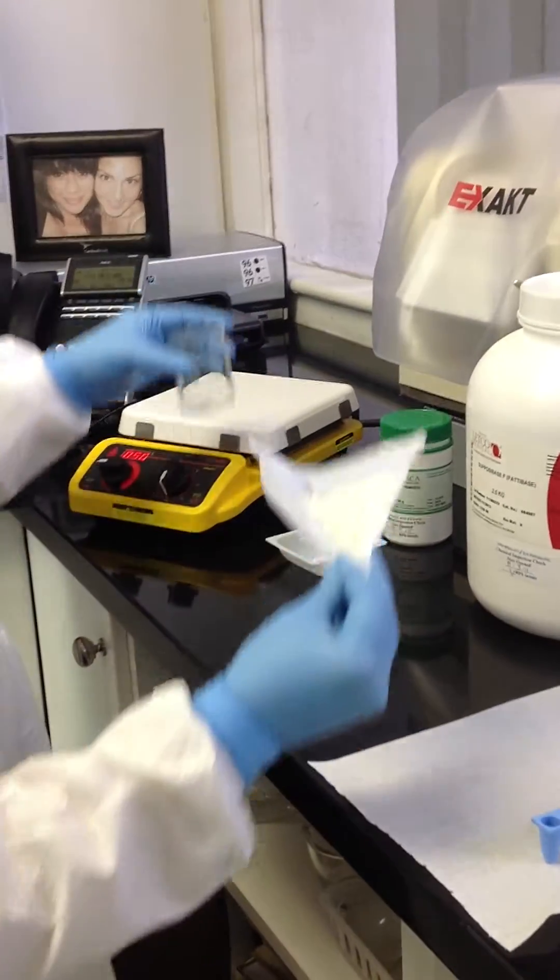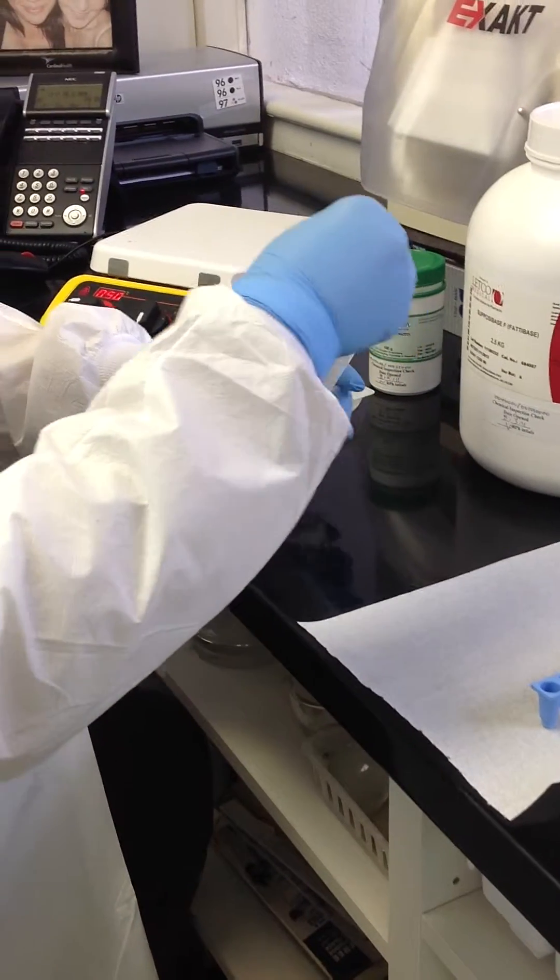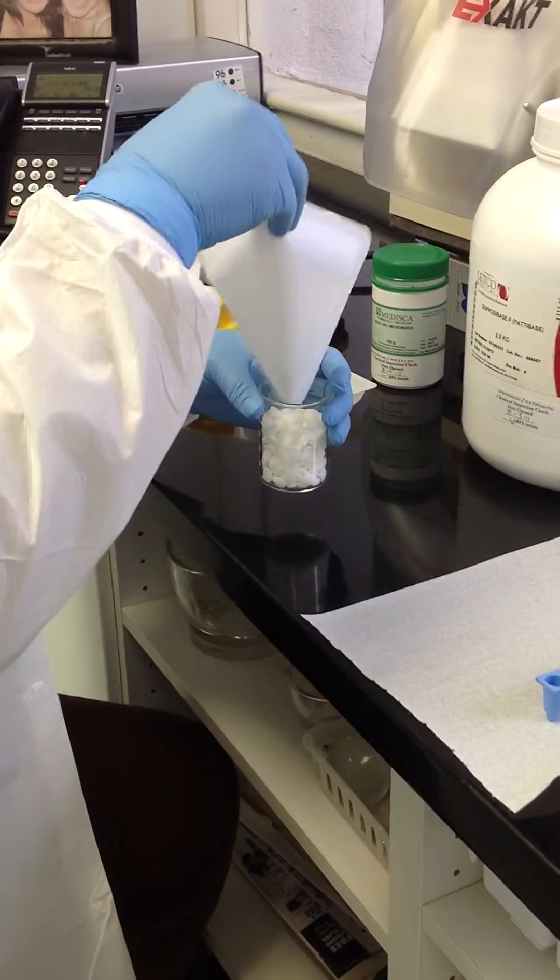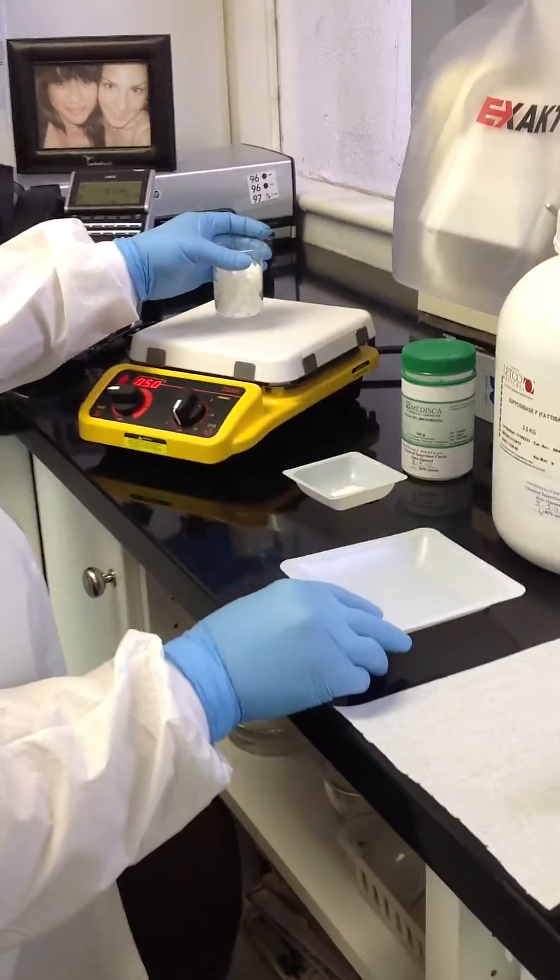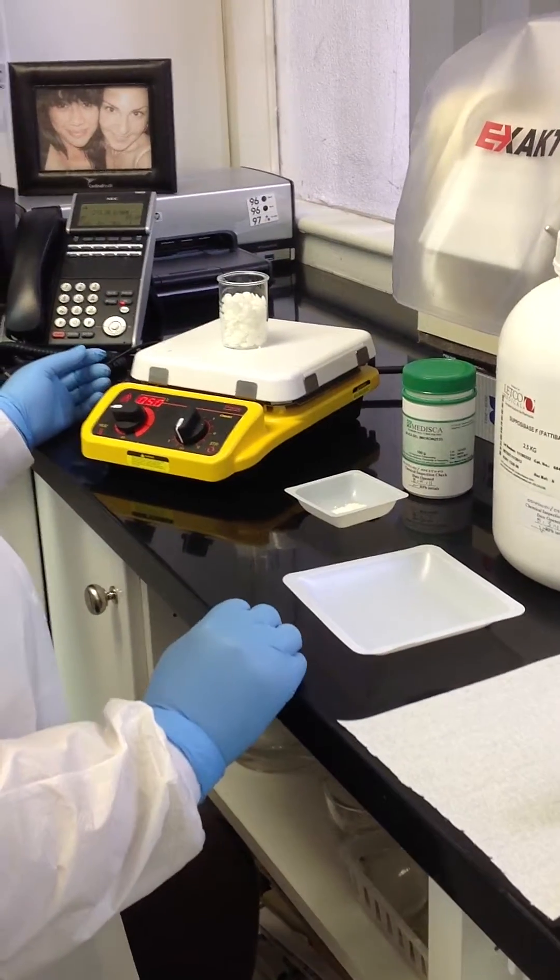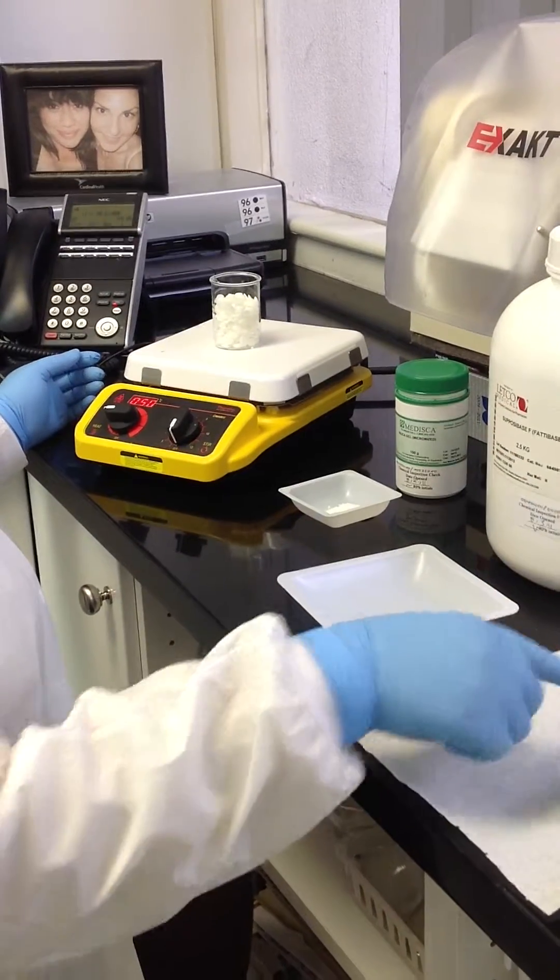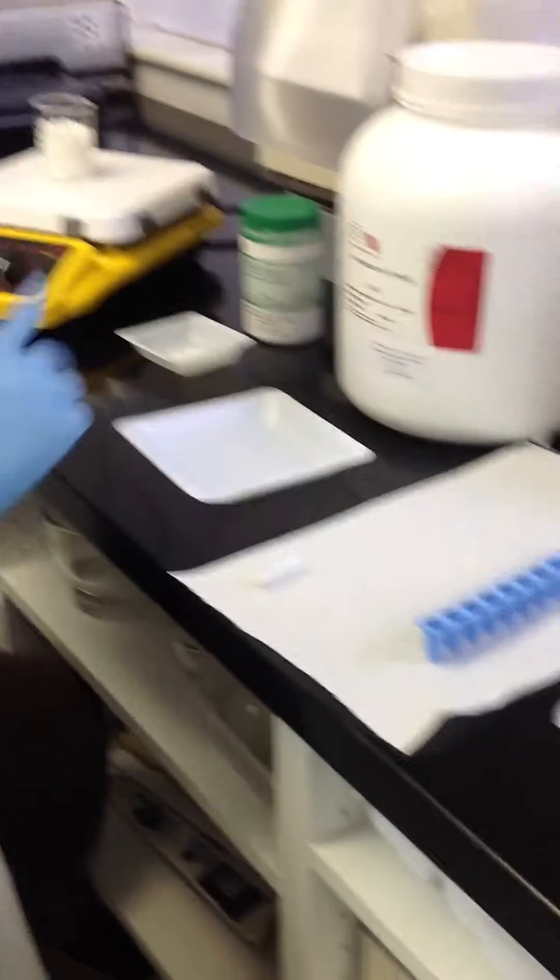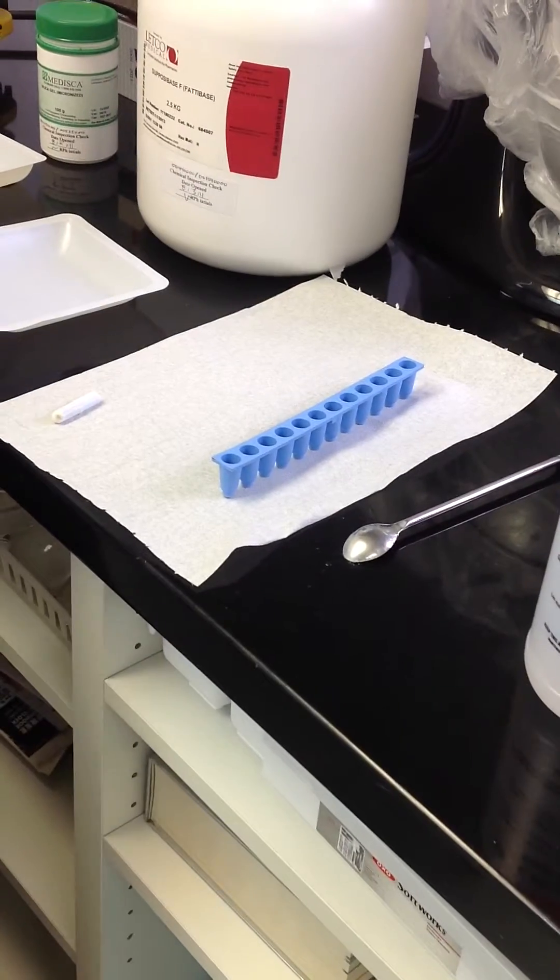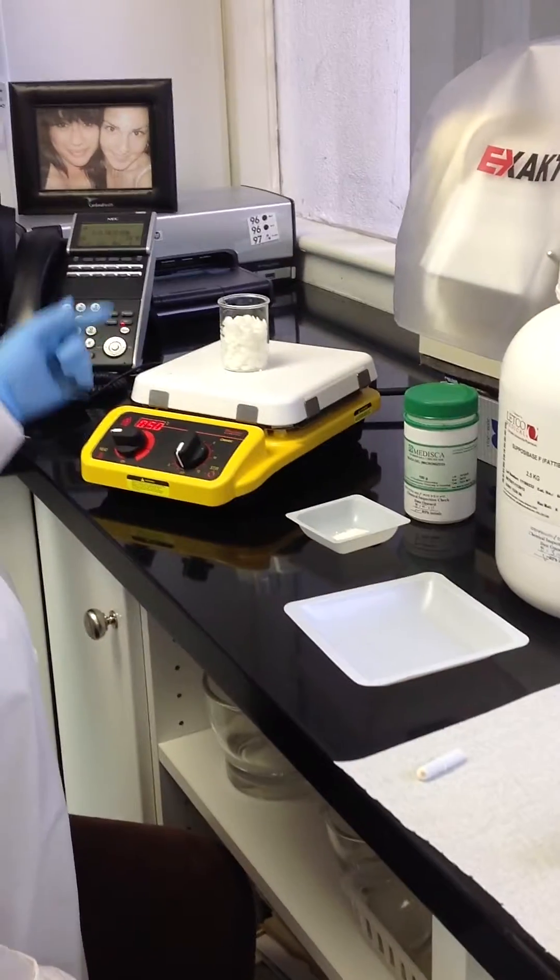You pour your suppository base into the beaker and set it here to melt. You leave your stir bar out at this point because you want to put that in once it's melted.